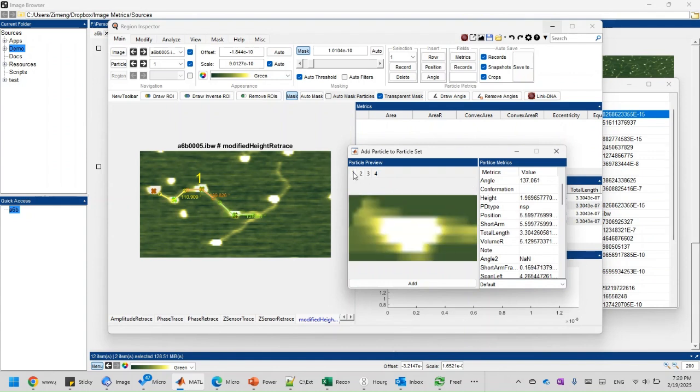By that, it basically enlarges the mask of the protein so that it can encompass a bit of DNA arms. It is defined as a circular mask with quadruple the area of the original mask, which is the protein complex. That's why you see a little bit of DNA arms also cropped. That's exactly what we want. We needed these DNA arms in order to classify its bending, DNA bending classification, as you saw earlier.